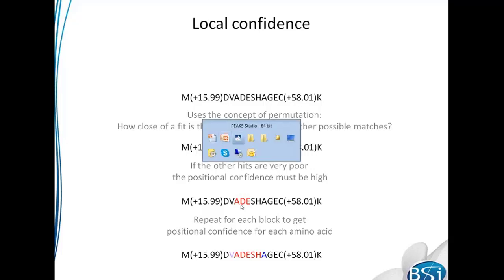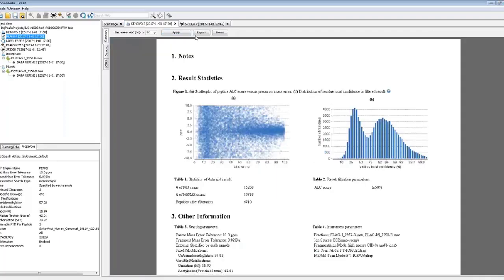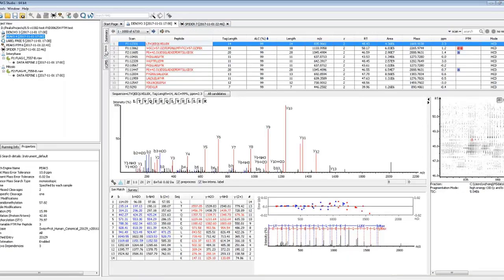All right, so let's take a look at how that works in the software here. So here we have your raw de novo sequencing result. And with every set of data that is run through PEAKS, you'll always get this de novo sequencing result. And if you click on this de novo tab, it will show you the most likely match to every spectrum that is given in your data file, so long as a reasonably confident match could be found.